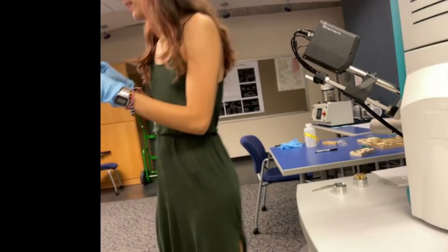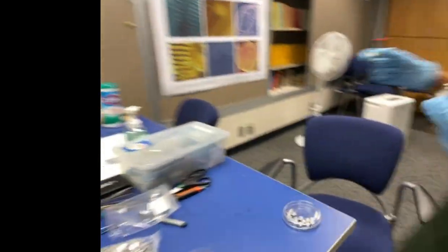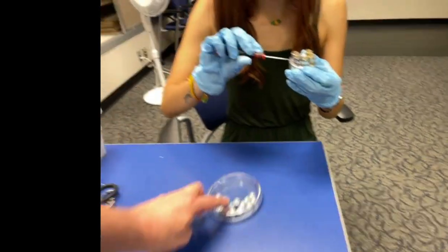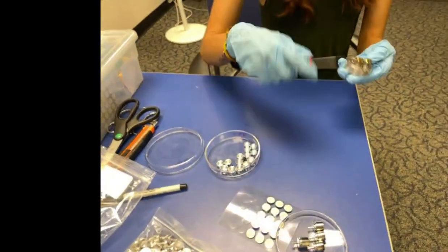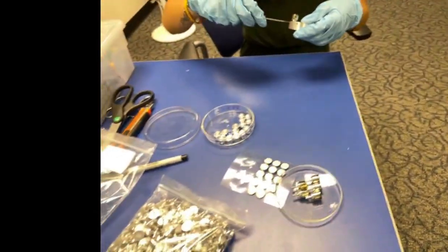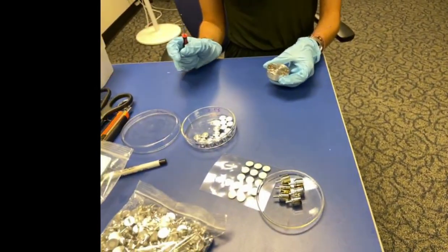What we're working on is we made some new stubs, which are here. So you can see the actual samples. There's 14 of them in that container, and only 7 will fit on the carousel. So we're going to prep 7 of them. Randomly?